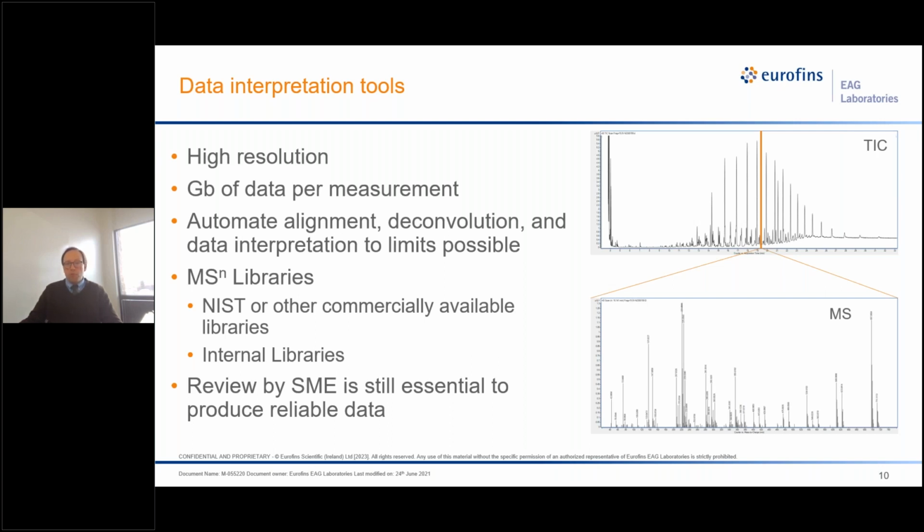And so we end up with roughly 5,000 of these MS spectra that are shown below. So if you think about an individual mass spectrum as a page in a book, which it certainly could be because we could have hundreds of peaks to observe in each mass spectrum, we have a book that's about 5,000 pages long, and that total ion chromatogram is the spine of that book.